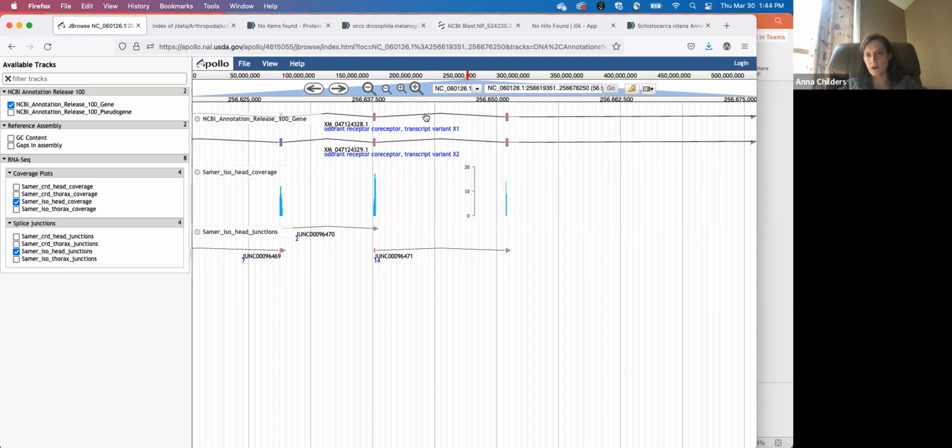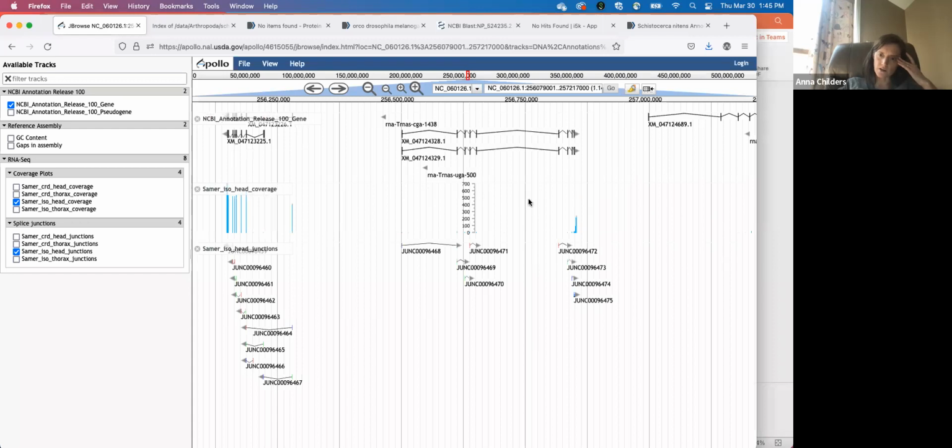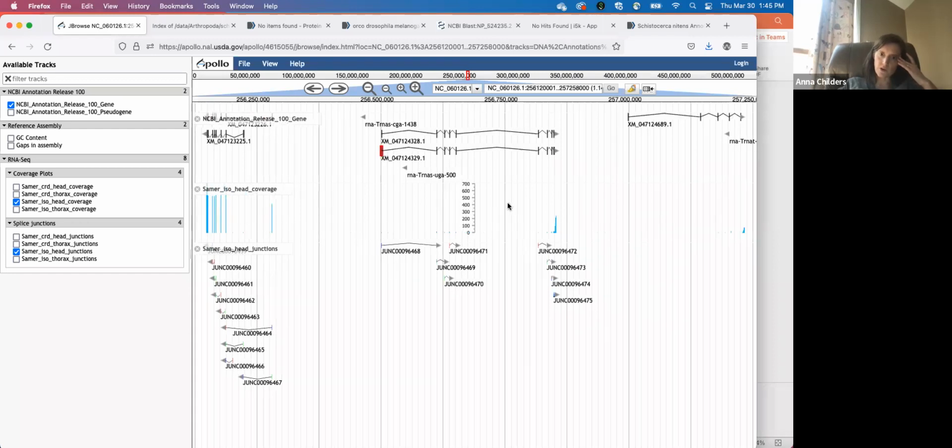But you may find that you feel only one is supported, or only the other is supported, or that there are other isoforms that are clearly supported by the data. And so that's a decision to be made when you're annotating, is how many isoforms are you actually going to annotate at a particular gene locus based on the level of data you've got in that space, right? So we might say, based on that one particular exon, that if the start sites and things work out, that it would look like a viable protein, that we might add a third splice variant in that place.